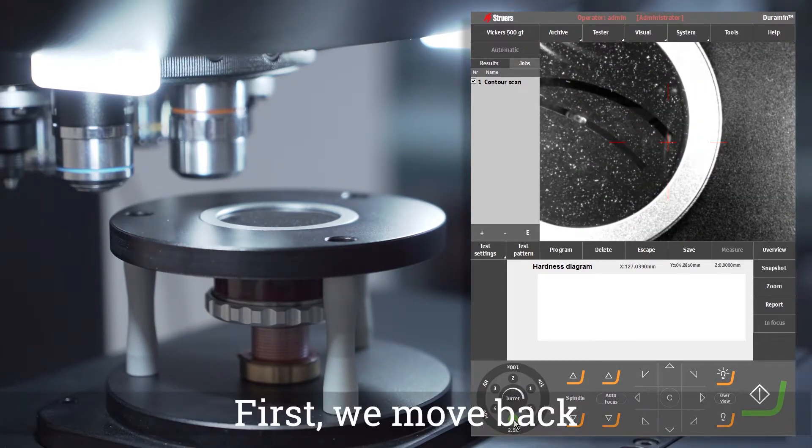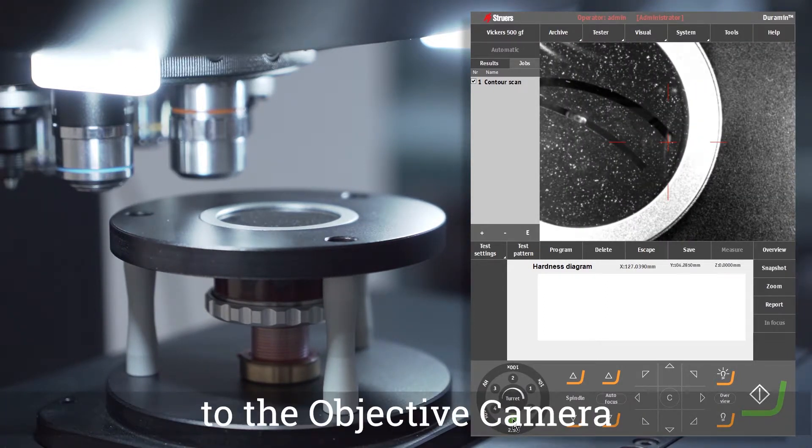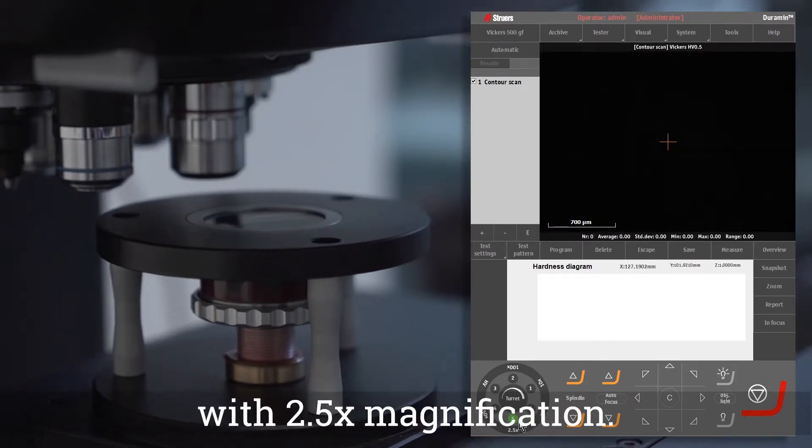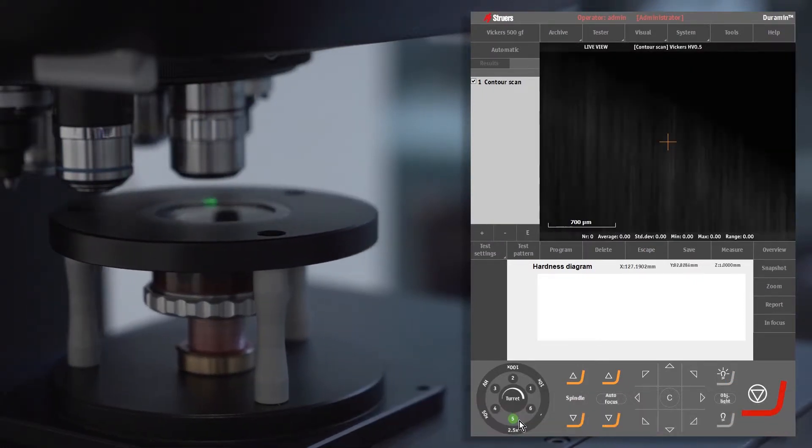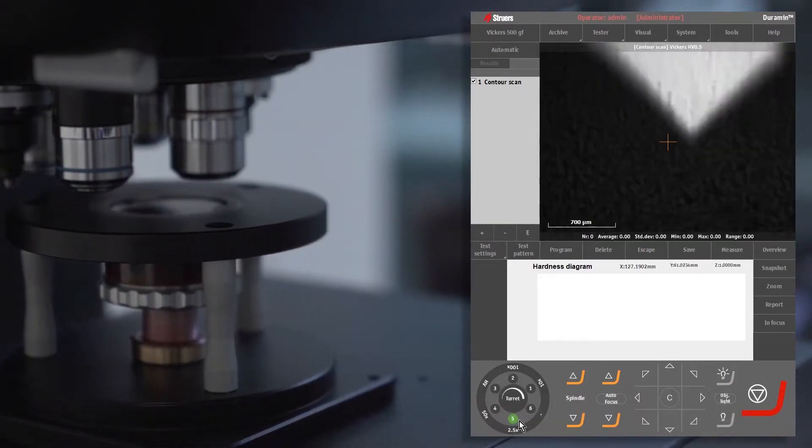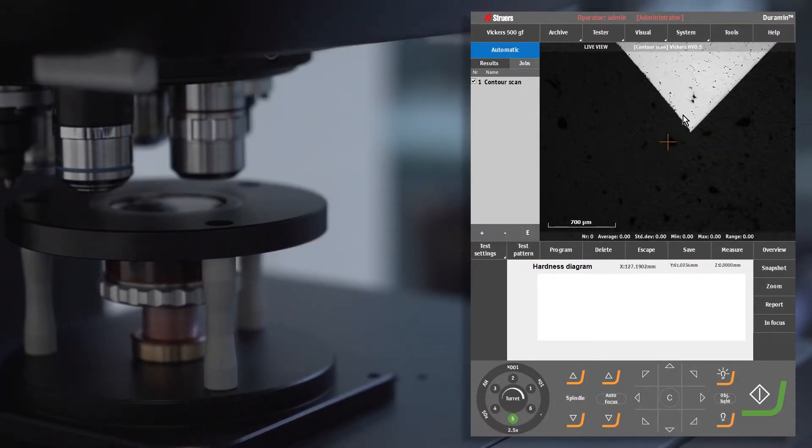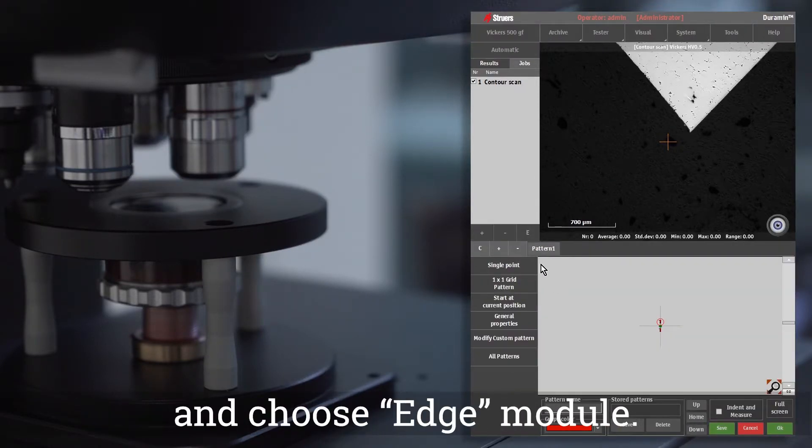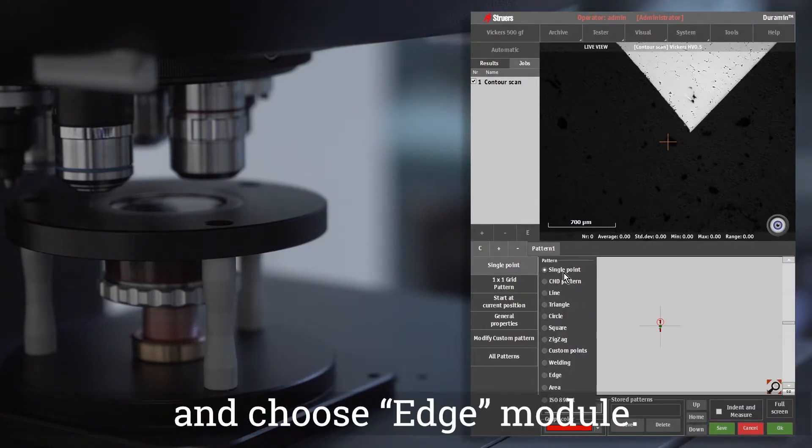So let's see how to do that. First, we move back to the objective camera with 2.5 magnification. Then we go to the test pattern section and choose edge module.